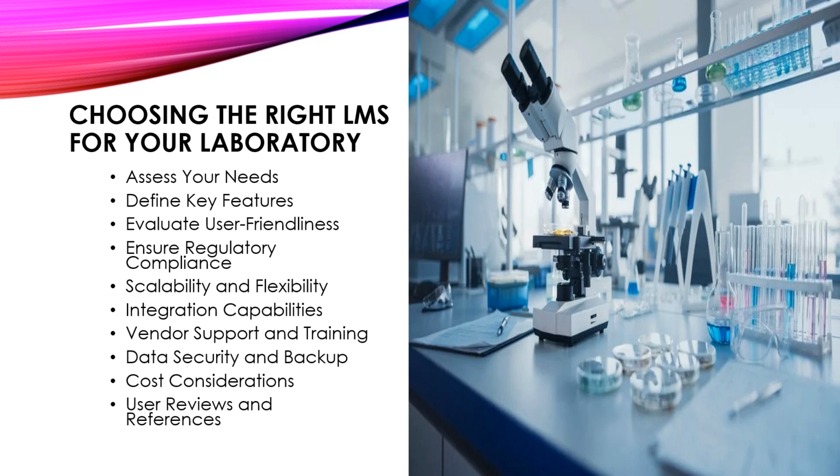Integration capabilities. Check if the laboratory management system can seamlessly integrate with other laboratory instruments, systems, and software such as electronic health records, laboratory information systems, and billing systems. Integration reduces manual data entry, minimizes errors, and improves overall efficiency.